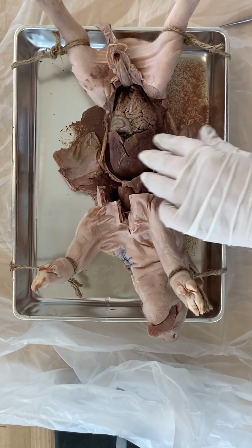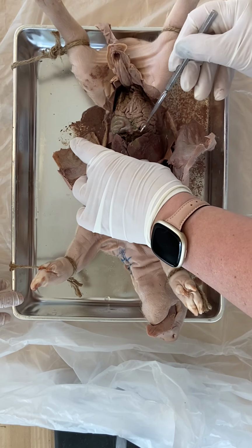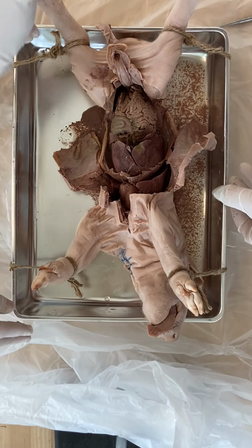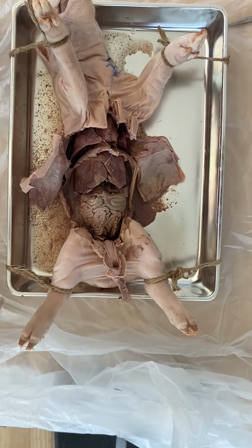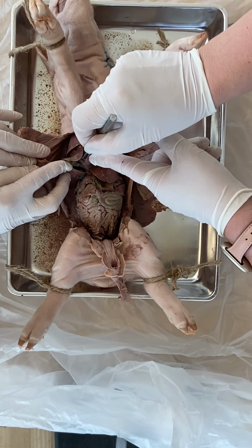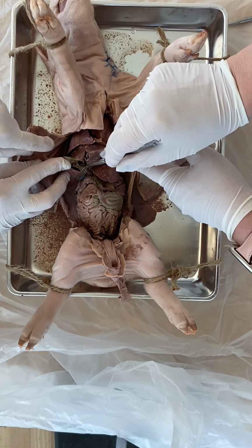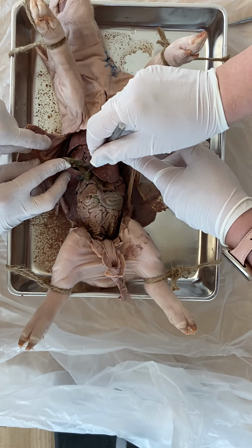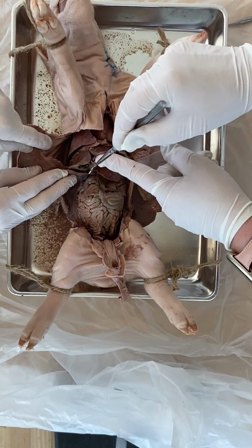All right, so this we have here is the liver. So here is the liver, making rather a mess. And then let's turn him around. And here, making a nice mess under here, is the gallbladder. You can see the green all around it, where it's dripped. So there's the gallbladder tucked up underneath the liver with the green bile, much greener than on the fresh pig.